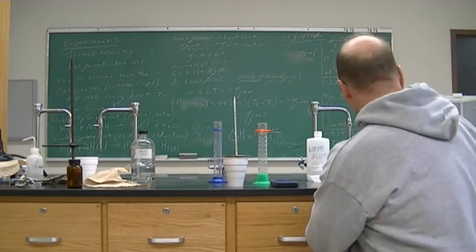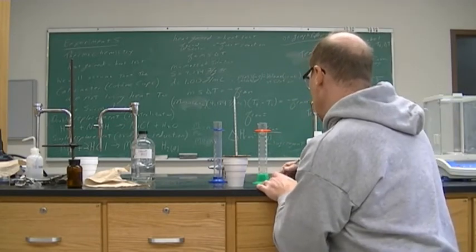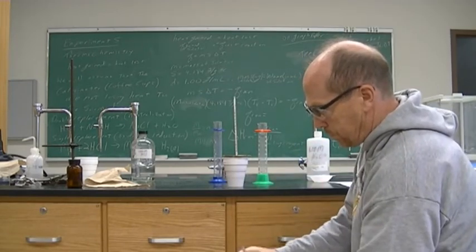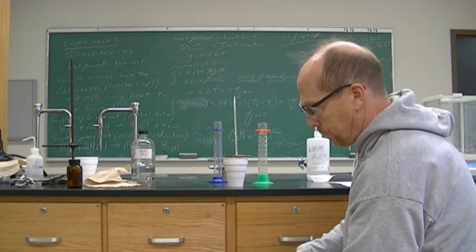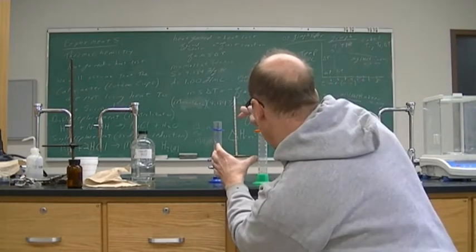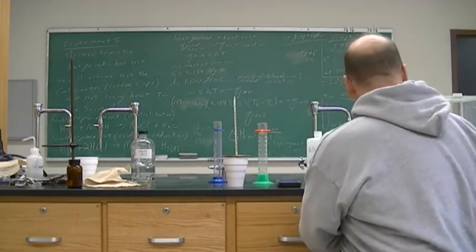So at the 3 minute mark, which is now, we have 31.2.